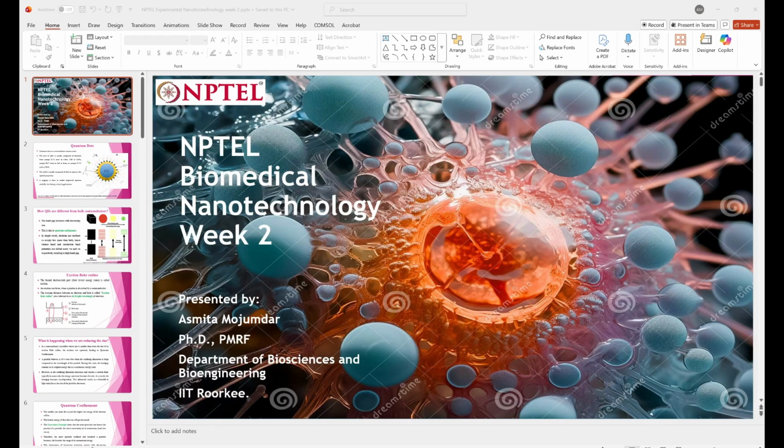DLS. What is the full form for DLS? No, not differential light scattering. It is dynamic light scattering. What else?